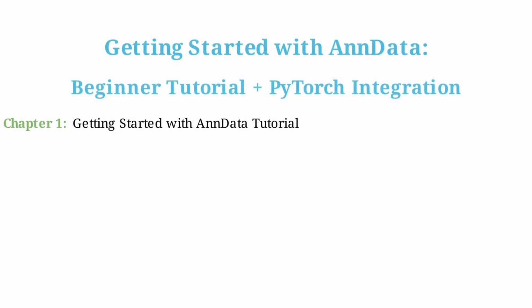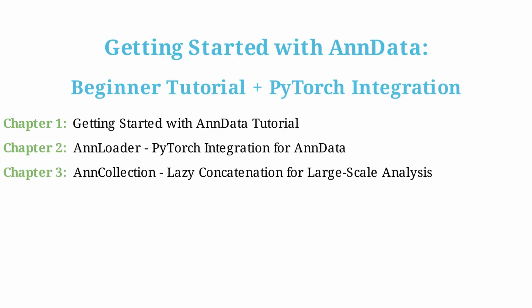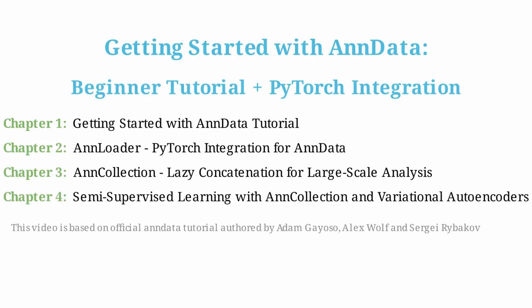Welcome to our comprehensive tutorial on Anndata. In this tutorial, we'll explore the fundamentals of Anndata and how it integrates with PyTorch for advanced biological data analysis. We'll start with Chapter 1, where we'll learn the basics of getting started with Anndata.